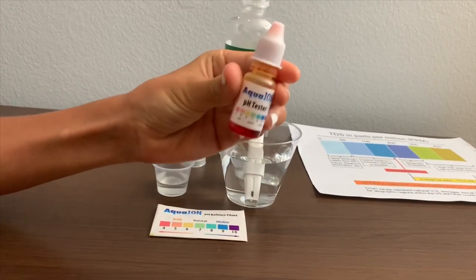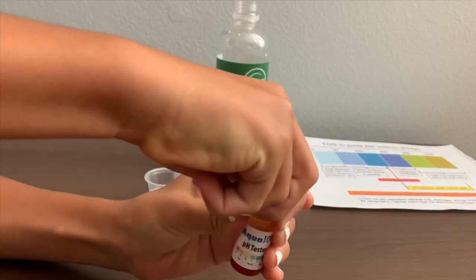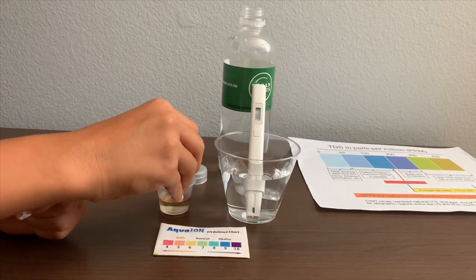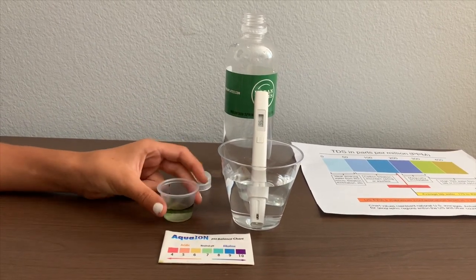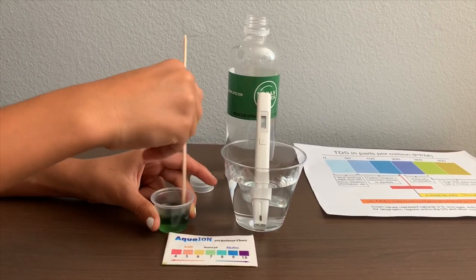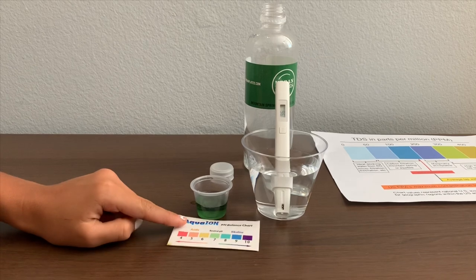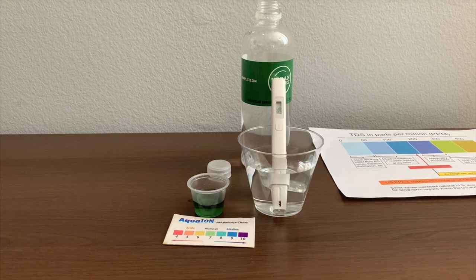Now let's test the pH level. If you want to buy this pH tester, check the link down below. Make sure you do two drops only. I'll show you — that's a 7.5. That is neutral pH.